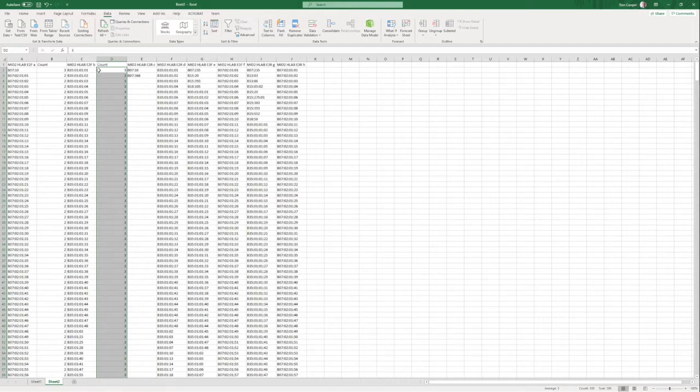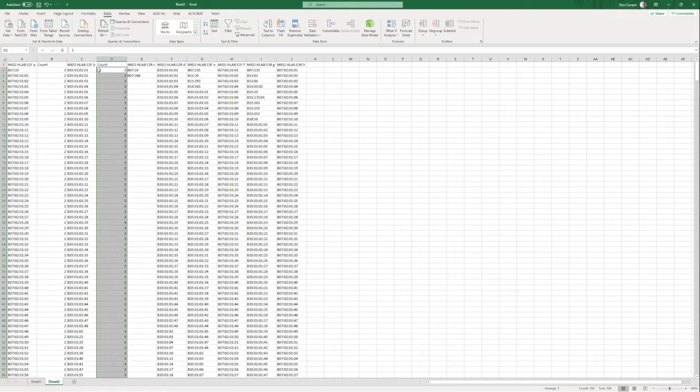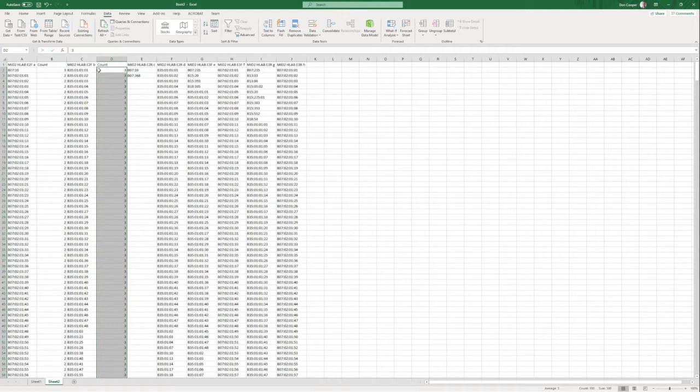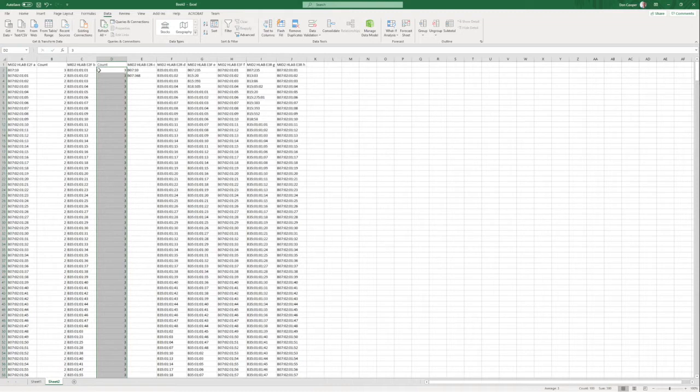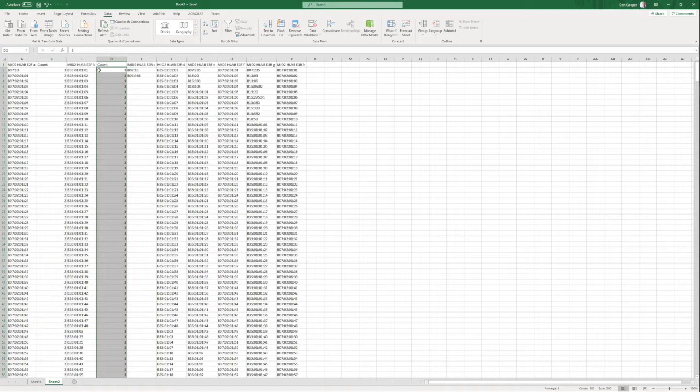The reason for this is because we are only looking at the sequences, the parts of the gene which belong to exon 2 and exon 3. If you remember an earlier video, we didn't look at the data which is intronic. And HLA genes consist of more than two exons. The reason that we are just looking at two exons is because these two exons encode a very important part of the gene, which is for many people the main part that they're interested in. Traditionally, this is the part that most people have called HLA alleles from, just these two exons.